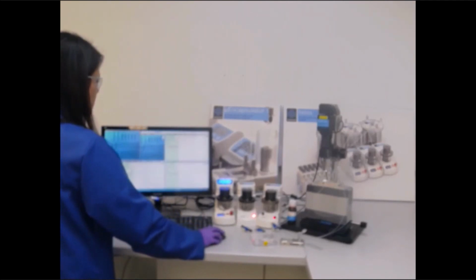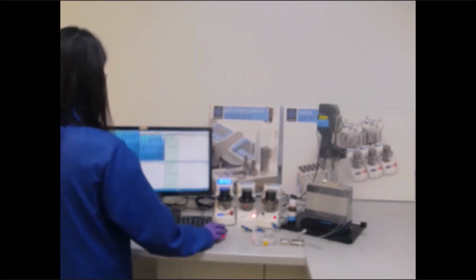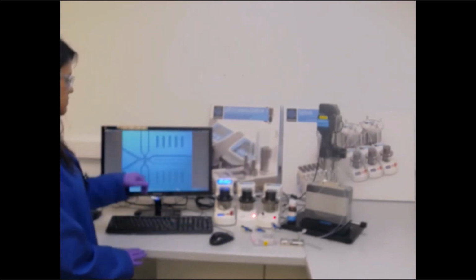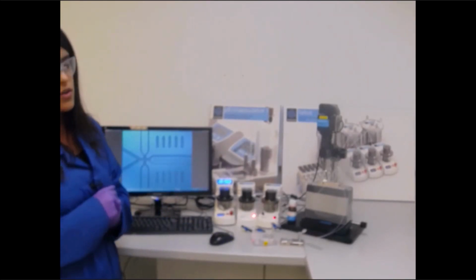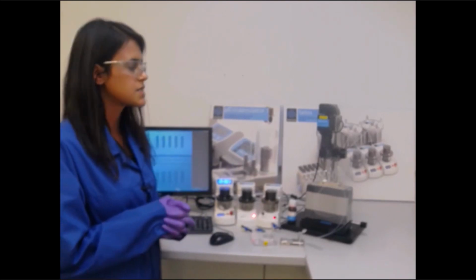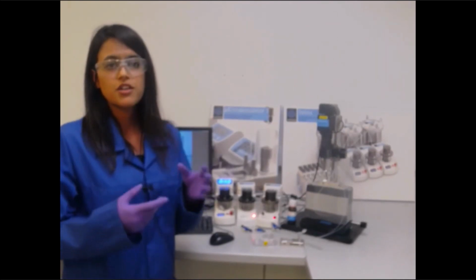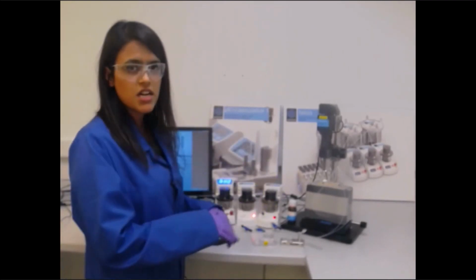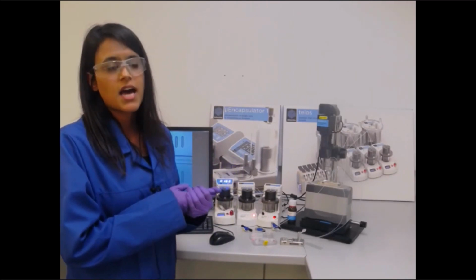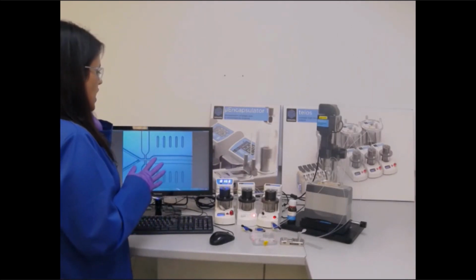If I so desire, in real time, I can manipulate the size of these droplets by simply changing the flow rate. So by doing that, you can see immediately the droplets are much, much smaller. So there's a lot of control over how you can manipulate your droplet size, and also throughput. So once you have some conditions in mind, you can always set everything up, and it's very, very reproducible. You're able to put in the same flow rates, and it'll give you the same size every single time. So that's what it looks like.